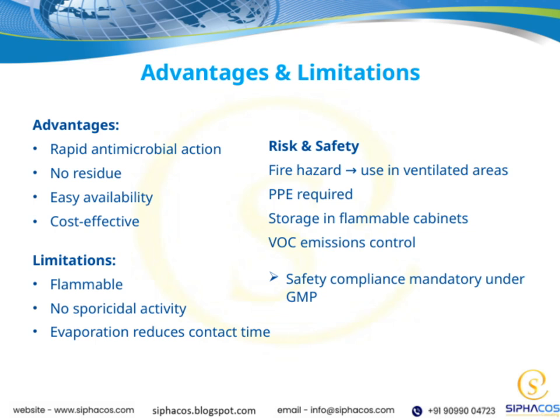Now let's look at the advantages of these disinfectants. They offer rapid antimicrobial action, which means they work quickly to eliminate microbes. They leave no residues, so there's no need for extensive rinsing, and they are generally easy to find and readily available. Plus, they're cost-effective, making them a practical choice in many settings.